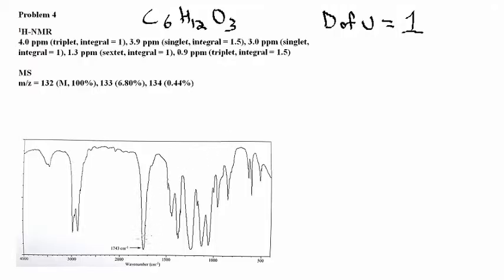Because we have the prominent C=O stretch here for the carbonyl group, we can guess that we probably use that double bond there, so there shouldn't be any other double bonds in the molecule. Now let's look at the rest of the IR spectrum. There is no broad OH stretching peak attributed to an alcohol. We don't even need to bother looking for the NH stretching based on our molecular formula.